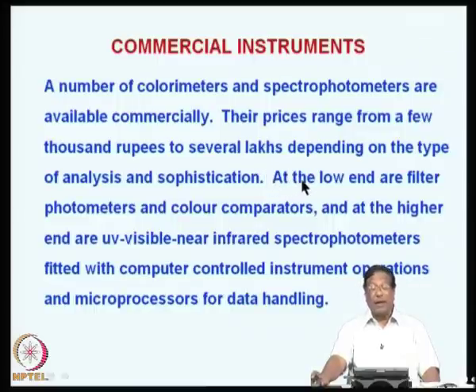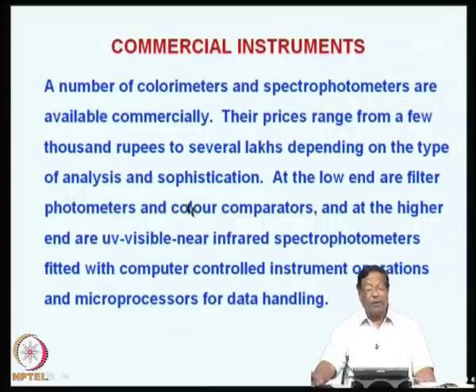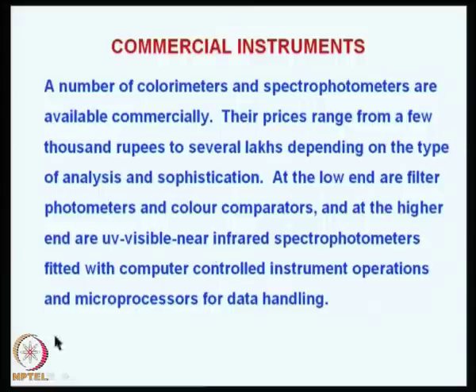So, at the low end are filter photometers and color comparators. These are the cheaper ones, and at the higher end are UV visible near infrared spectrophotometers fitted with computer controlled instrument operations, process operations, etcetera, and they are also fitted with microprocessors for data handling.